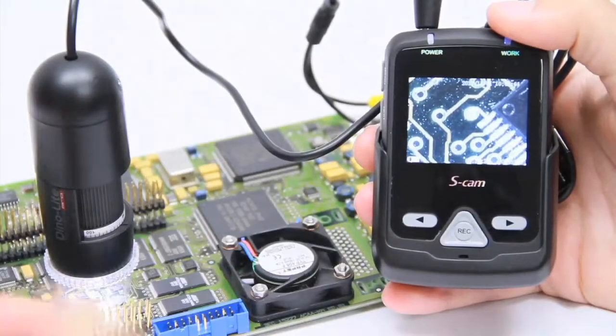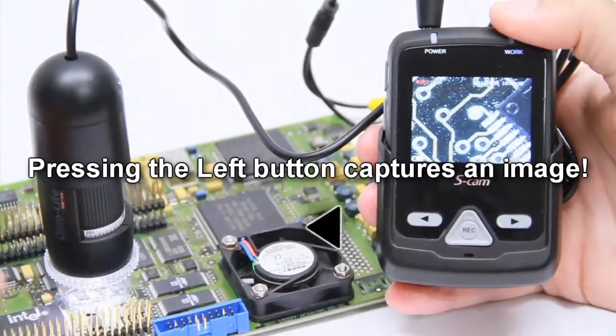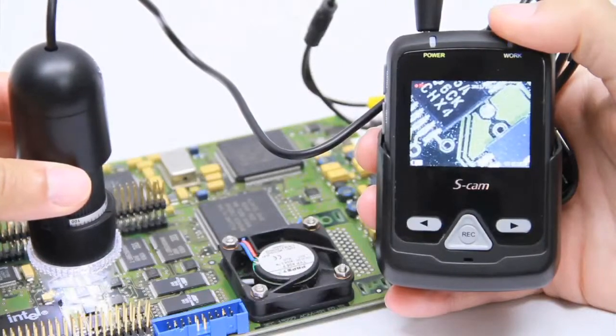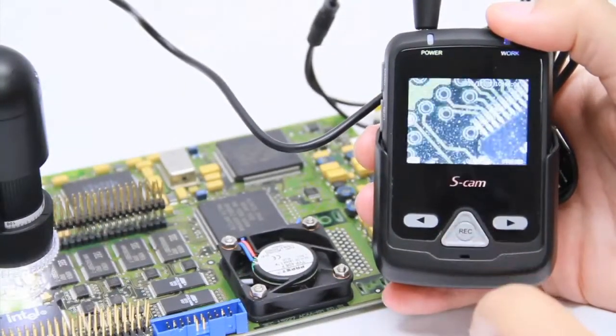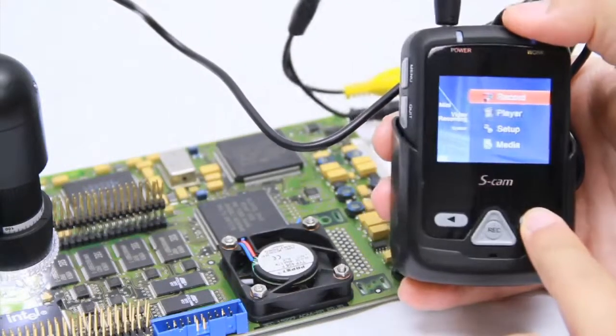Press the record button to start the video capture. Pressing the left button will allow you to snap a photo. Press the record button a second time to stop the video capture. Pressing the side button will allow you access to the menu screen.